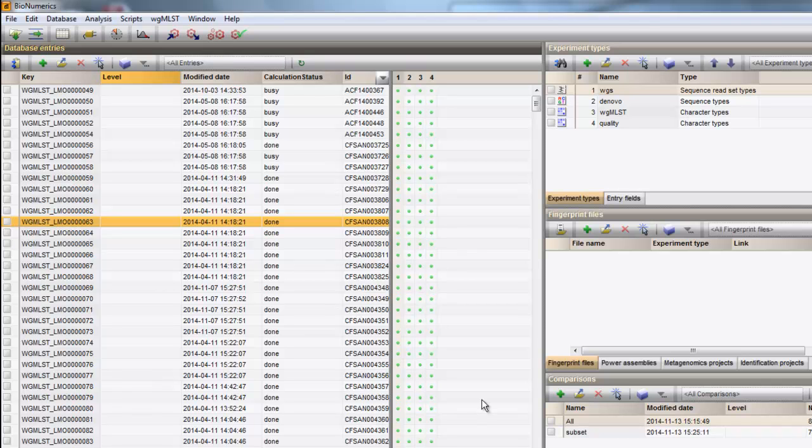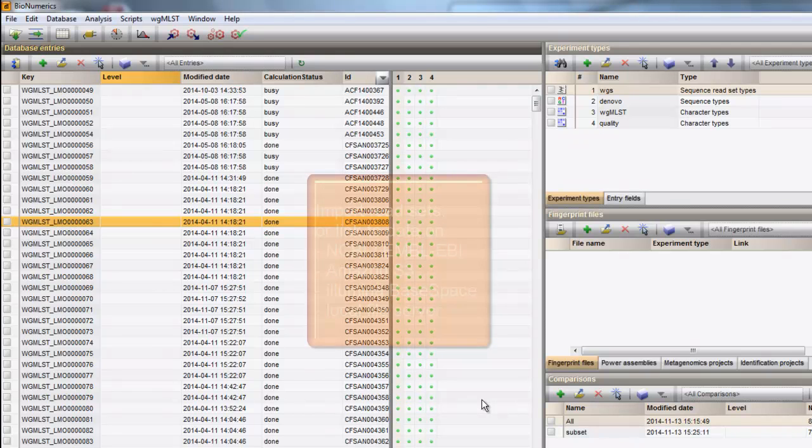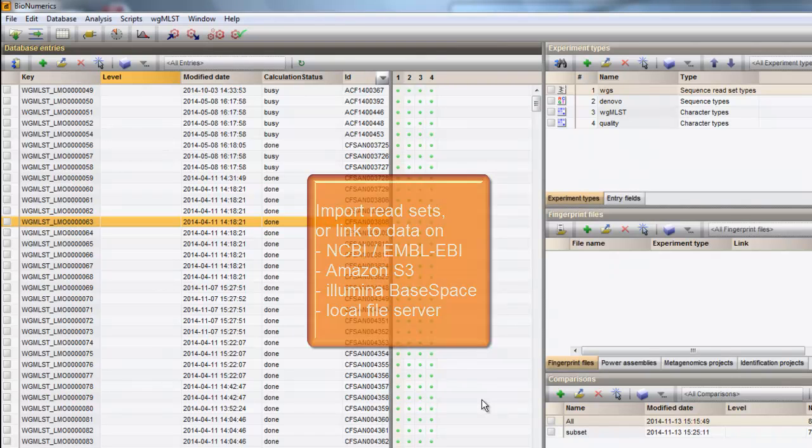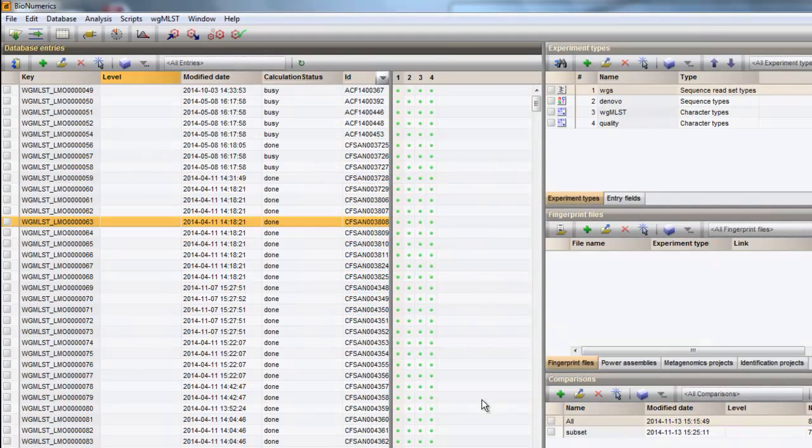Read sets may, but don't necessarily need to be imported in your Bionumerics database. Bionumerics can link to batches of sequence read sets from either NCBI or EMBL, Amazon S3, Illumina BaseSpace or local file servers.